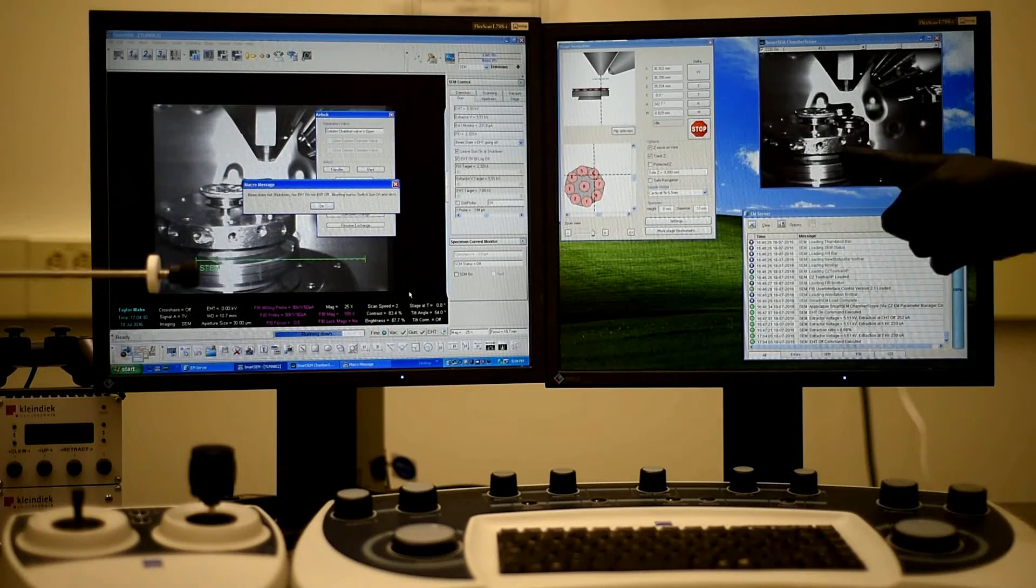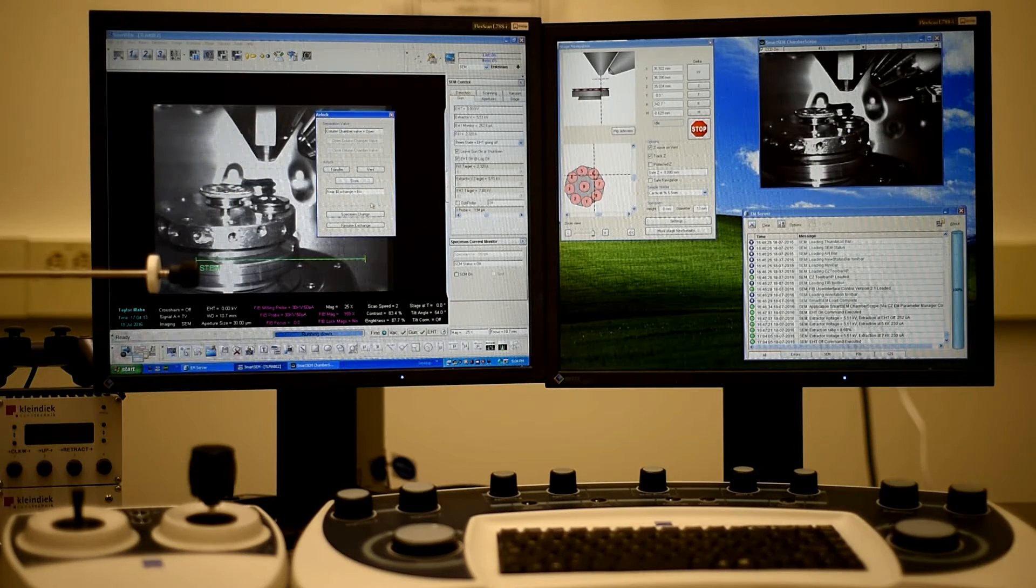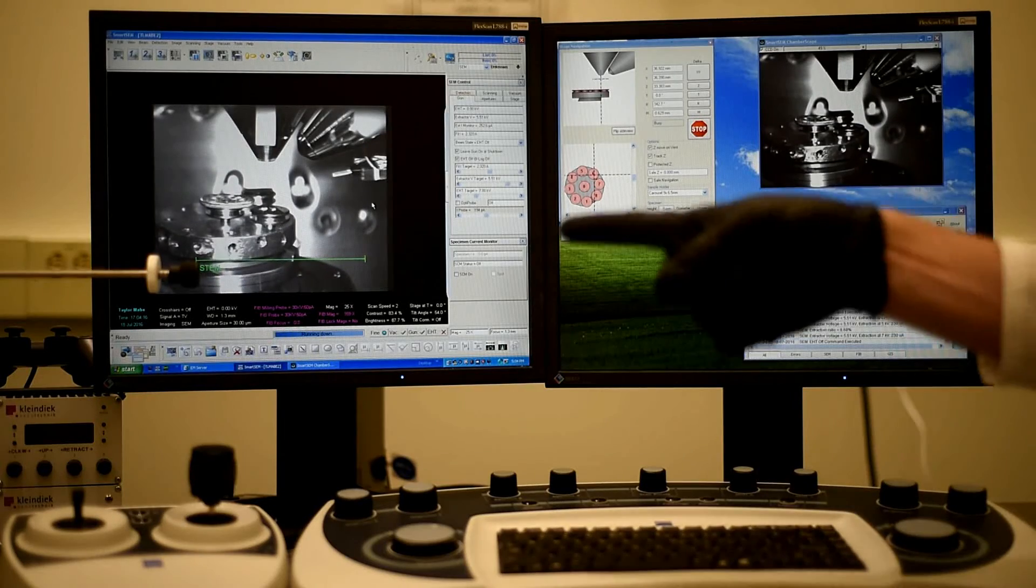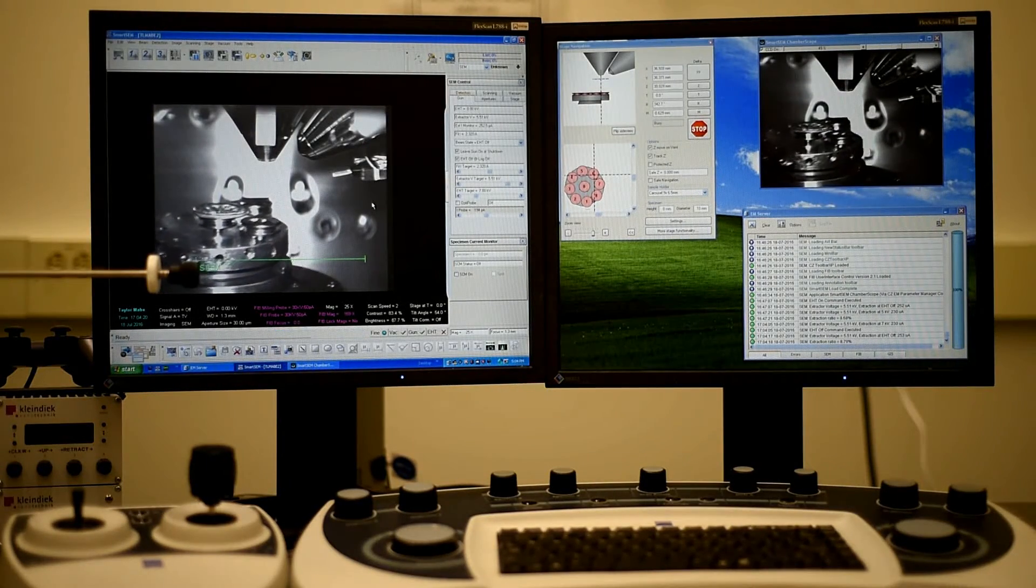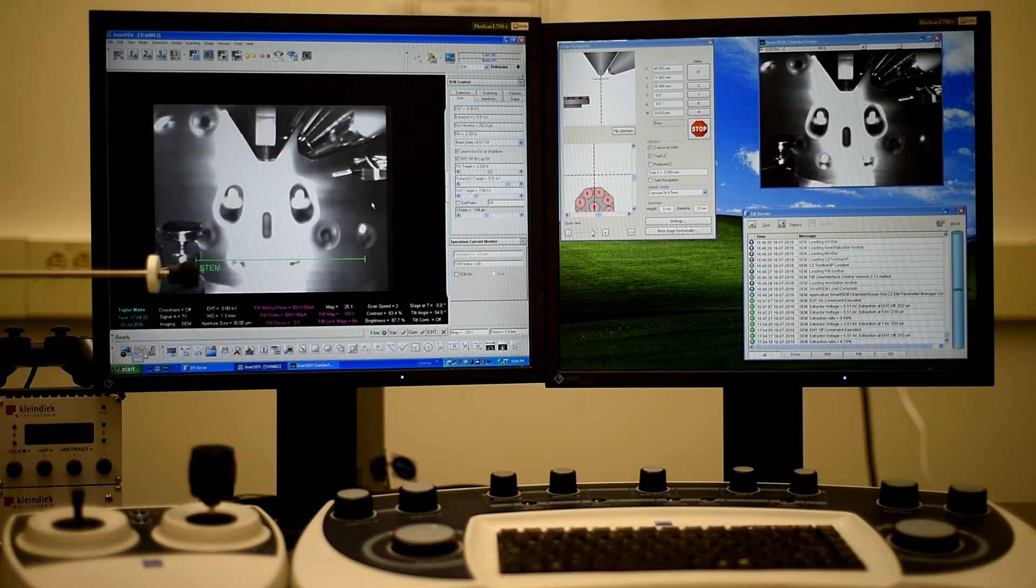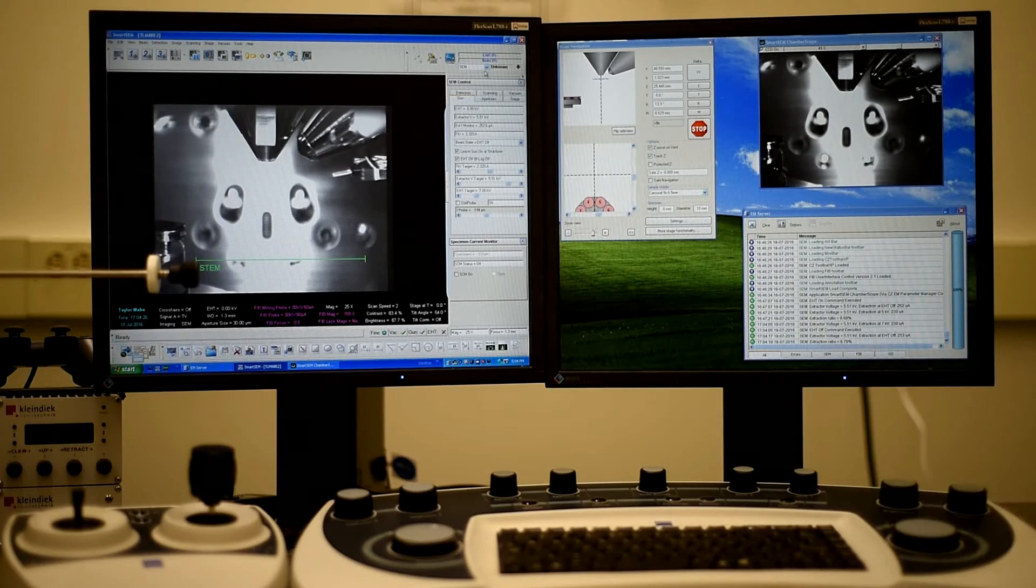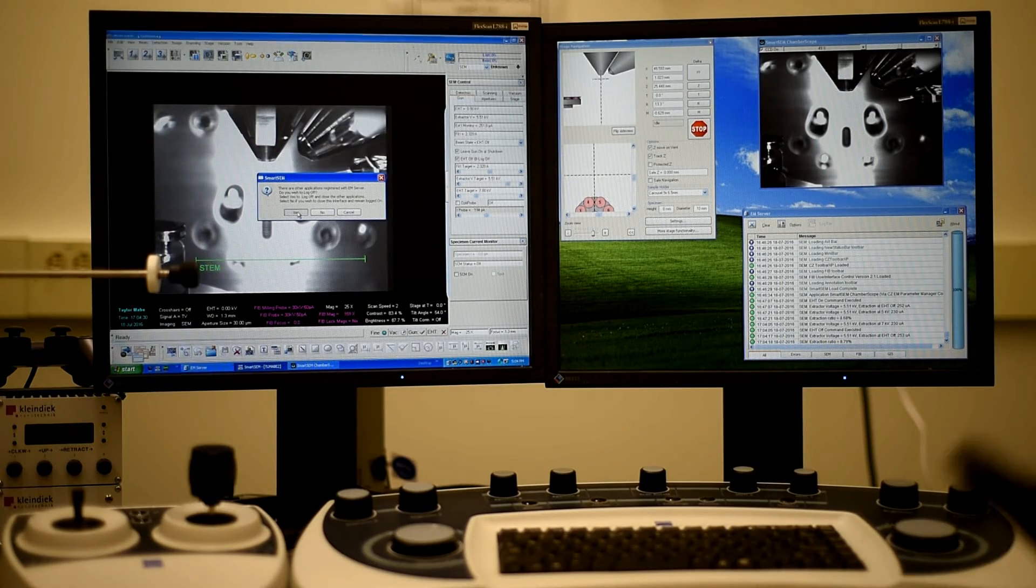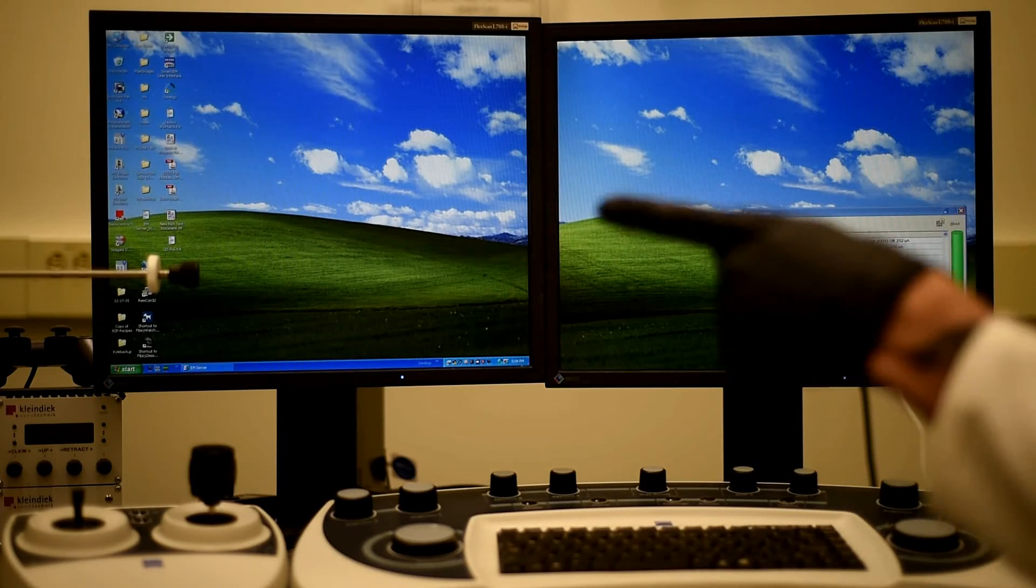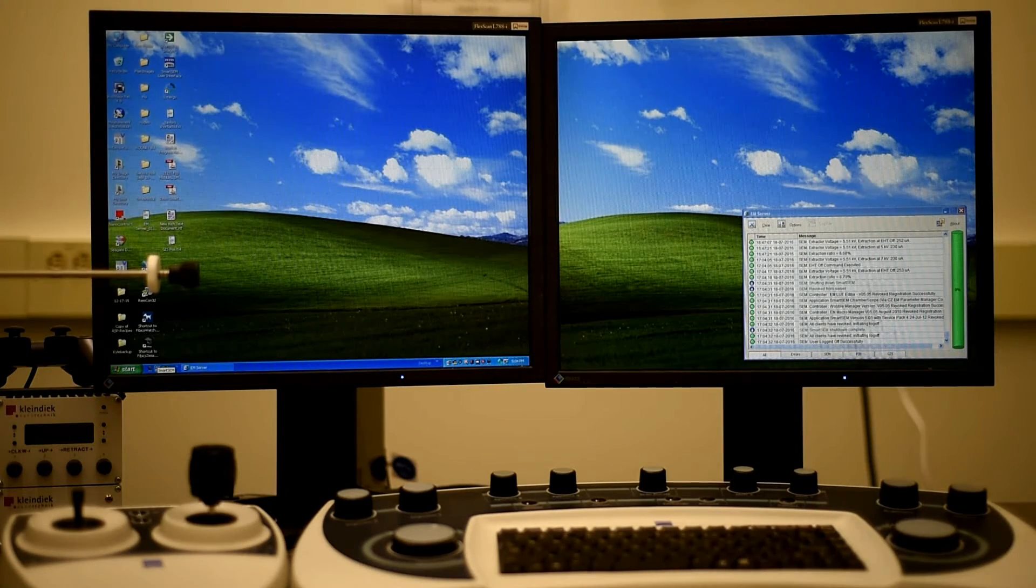And line it up so that we can remove it with the airlock that we used to introduce the sample. So at that point, when it's lined back up, we can exit out of this and then click yes. And then we'll move to the airlock to show you how to take the sample back out.